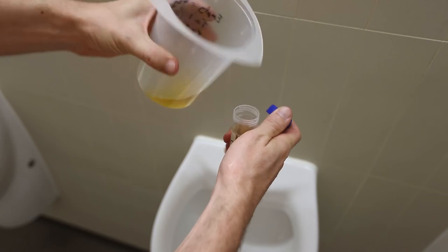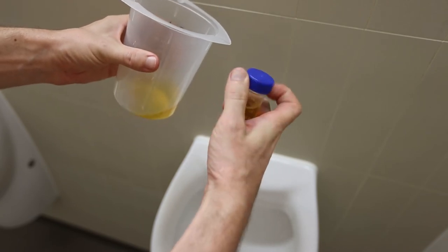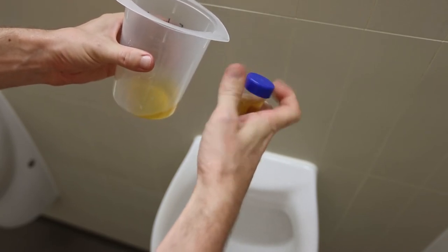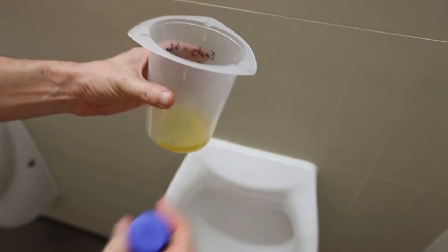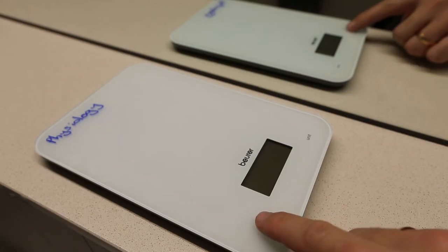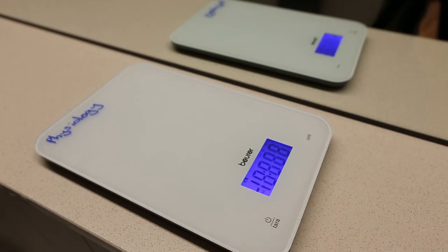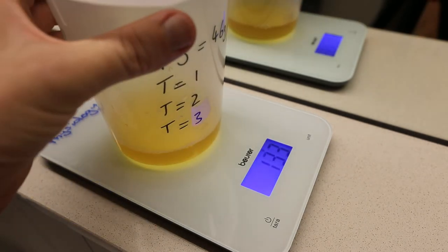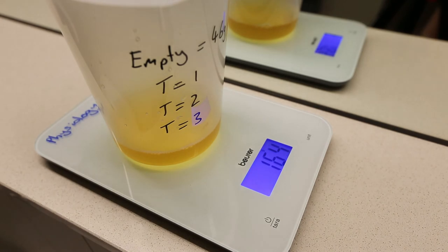For the other time points, before collecting the urine sample, you will need to measure the volume first. To do this, after collecting your urine into the beaker, place the beaker back onto the scales and again measure the weight of the beaker plus the urine. Since you know the weight of the empty beaker, you can now calculate the weight of the urine.